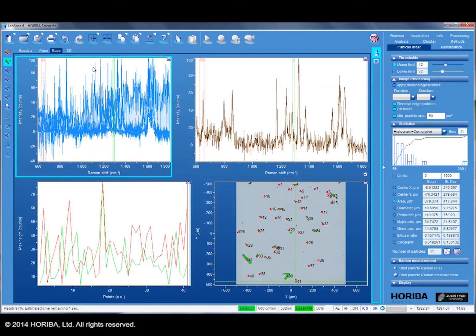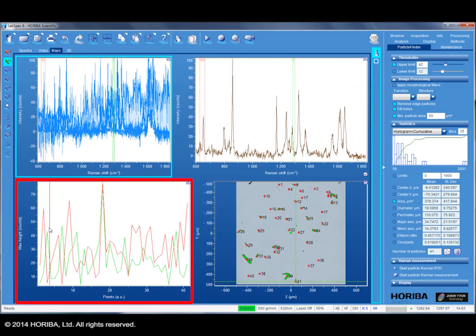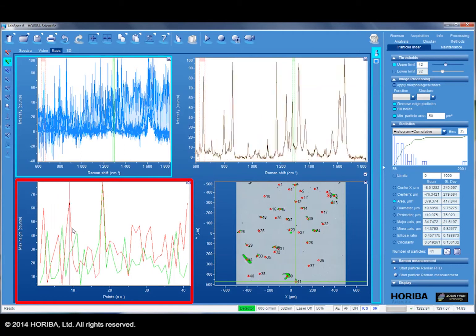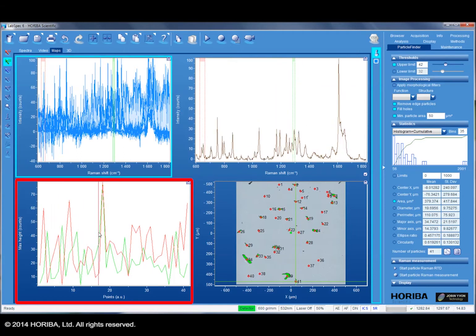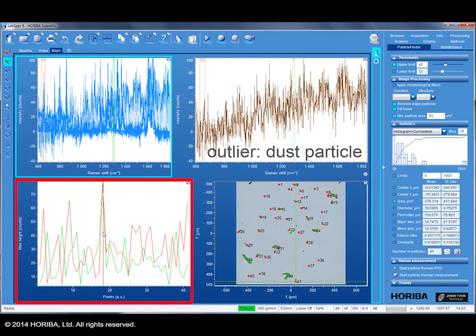Browsing through the individual spectra immediately highlights clear spectral differences between particles. The outlier spectrum shown here originates from a dust particle, which shows no Raman spectral features.